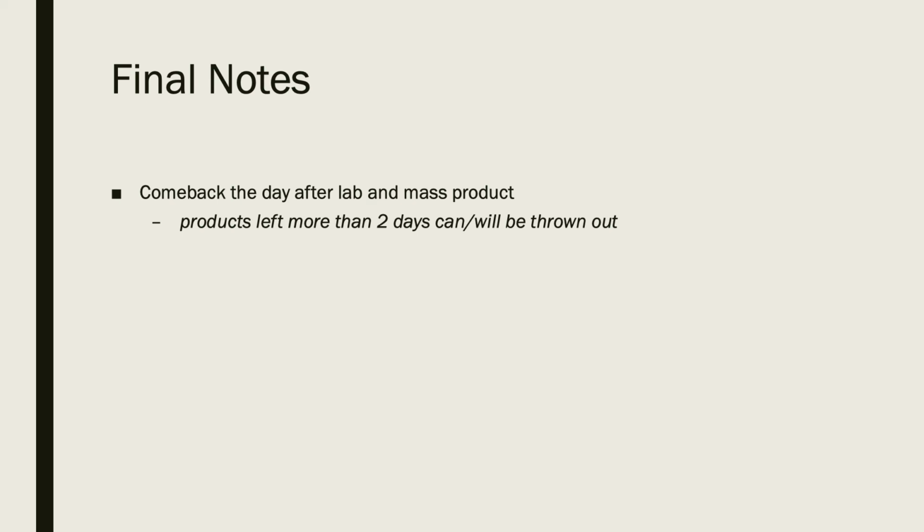When you do come to mass your product, please go ahead and just throw it away, and it can just go straight in the trash. There's no special disposal for the copper product. You can just throw it in the garbage.